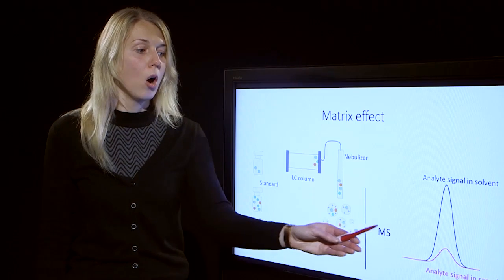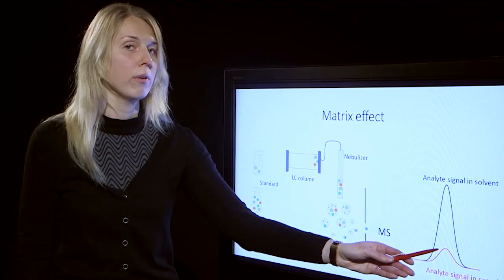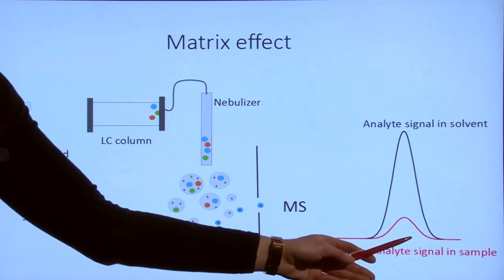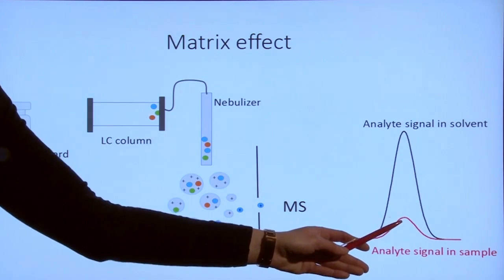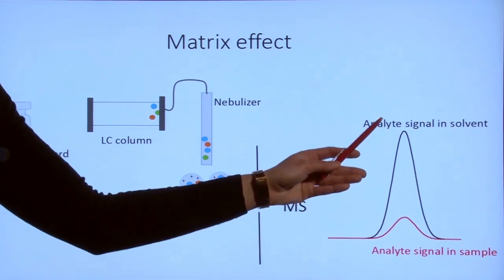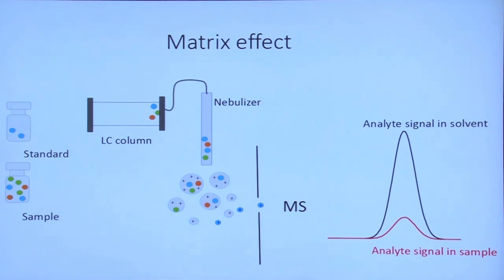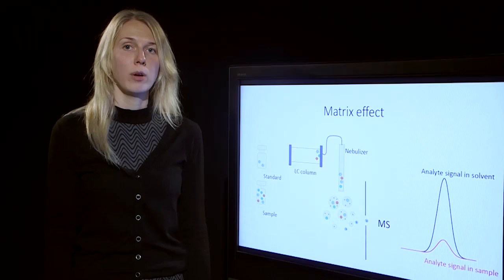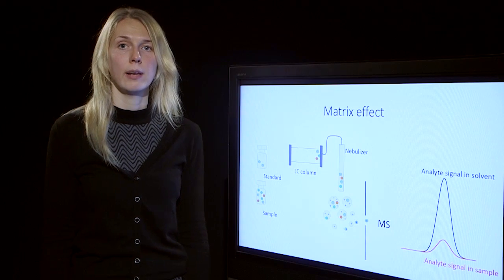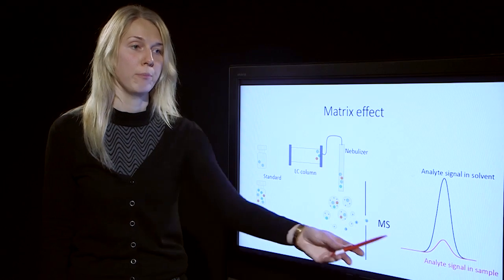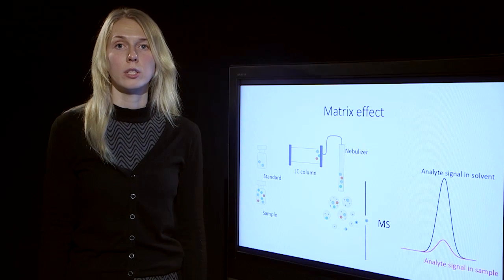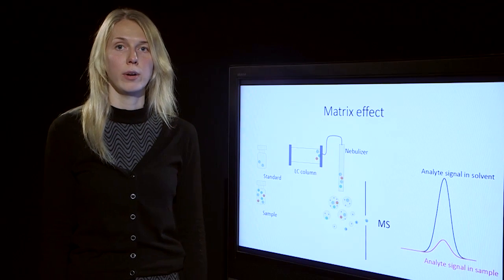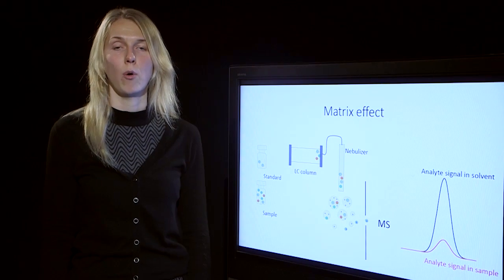Therefore, on the chromatogram we will observe a peak that is smaller for the sample than for the analyte, even though the concentrations are the same. This means that we obtain significantly underestimated results for the sample, and this may be a very serious bias for our analysis.